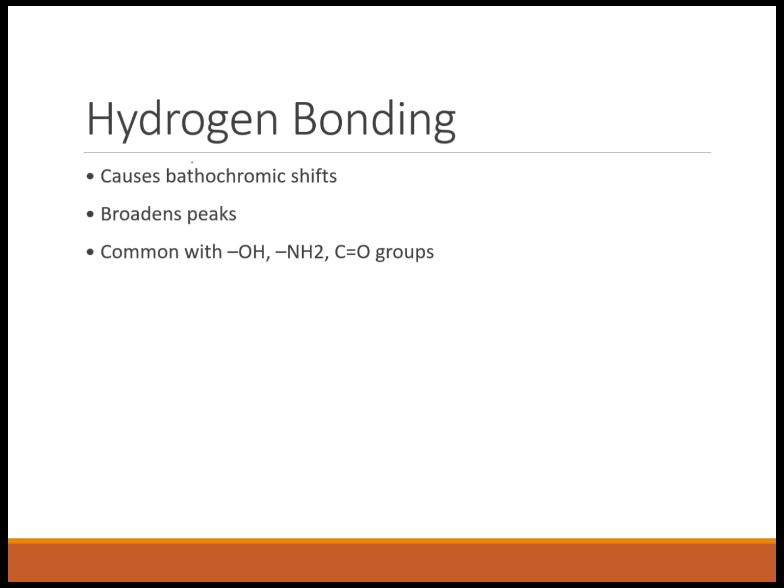It typically broadens peaks and shifts lambda max. It may reduce absorbance intensity. Hydrogen bonding is most significant where hydroxyl, amino, and carboxylic groups are present.